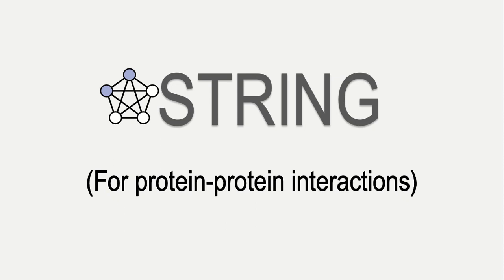Hello everyone, in today's video I will show you how you can check protein-protein interactions. If you want to know whether your protein shows interaction with other proteins, you can find out these protein-protein interactions by using a very useful tool called the STRING tool.